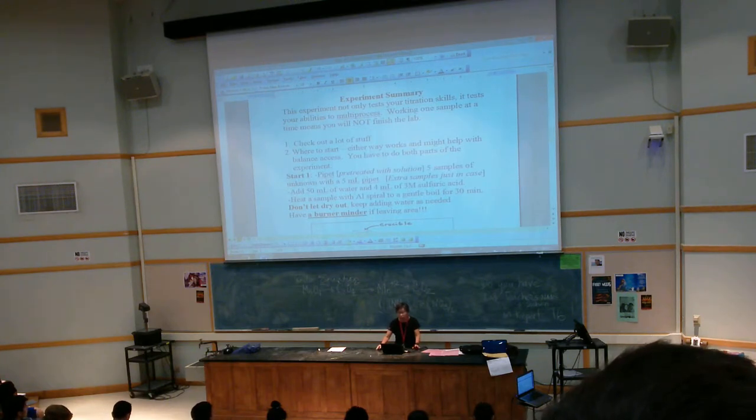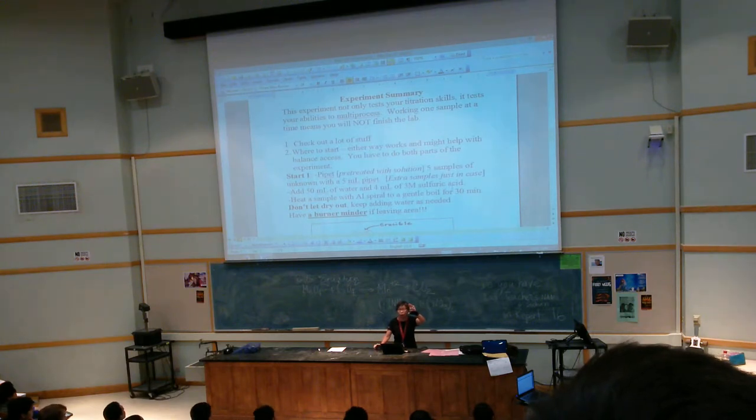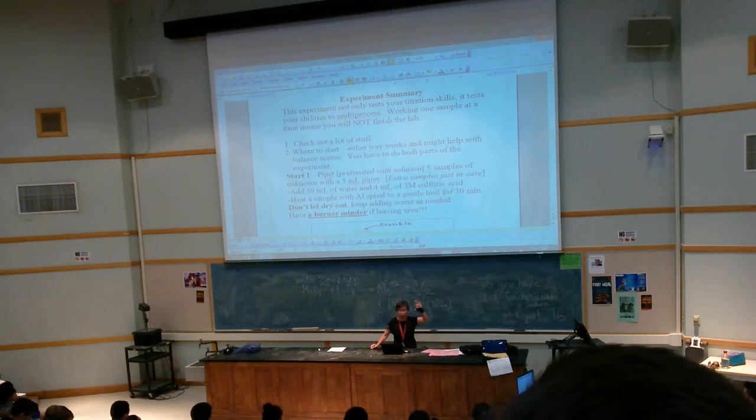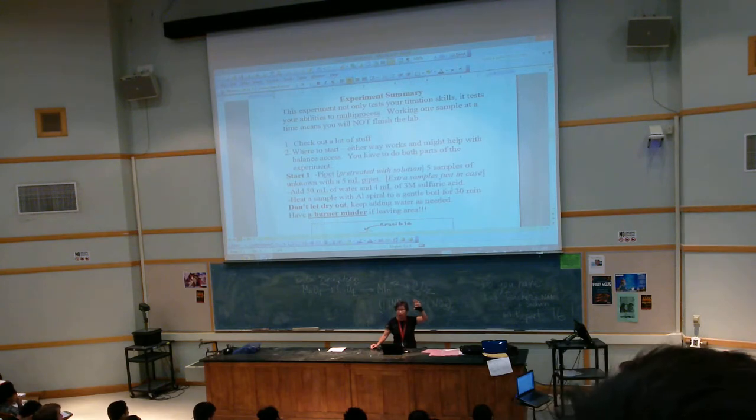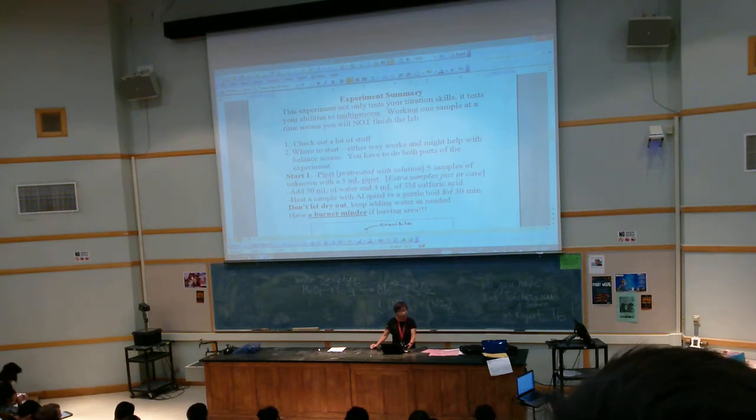So you're going to add 50 mils of water, that's in your procedure, and 4 mils of 3 molar sulfuric acid. I've had people not reading the label on the sulfuric acid. It's the one that says D-I-L, not C-O-N. You know the difference? What does D-I-L stand for? Dilute. I've had students throwing in the concentrated, okay? Wake up before you take any reagent bottle, okay?